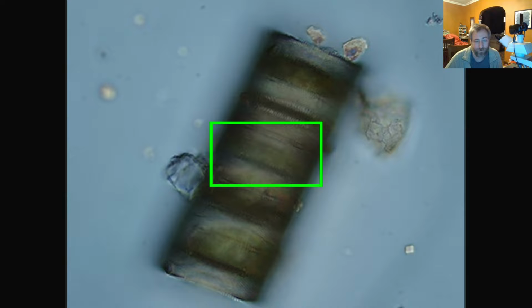So it's like an example of how you can match the diatom with a very specific type of environment. So if I were to do, like, the sample which Anna gave me, I'd never seen the collection site before. I had no idea where it was she collected it. And I was able to basically piece together that it was flowing water, that there were rocky substrates nearby, like a waterfall of some type, and that high flowing water with relatively low nutrients.